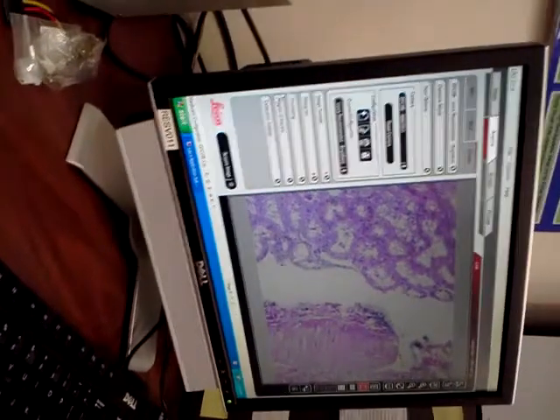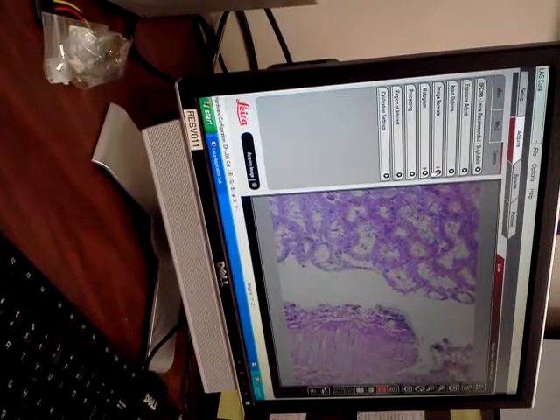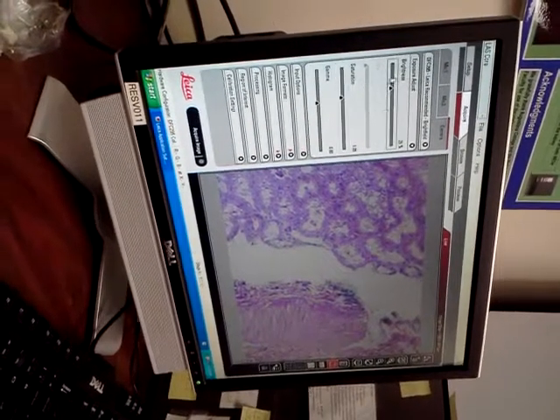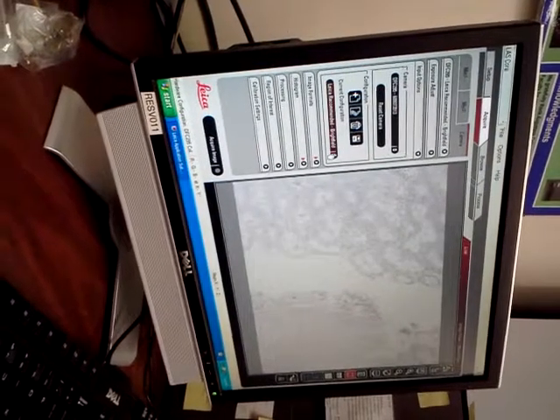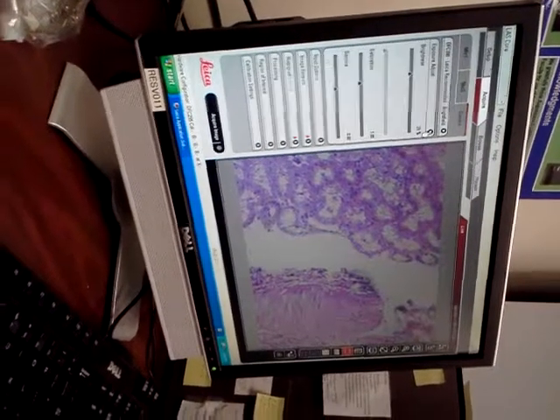So it saves whatever I do within my acquire tab. So I could change a bunch of stuff in here. Let's say you do that and, let's see, what can we change? We could do this, let's say. It looks terrible. I can come back in here, go back to my, like you recommended, and it'll go back.